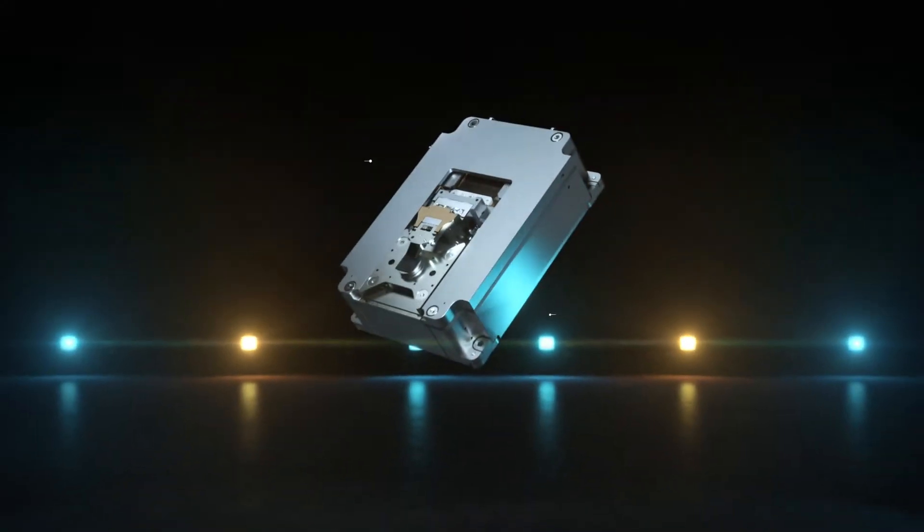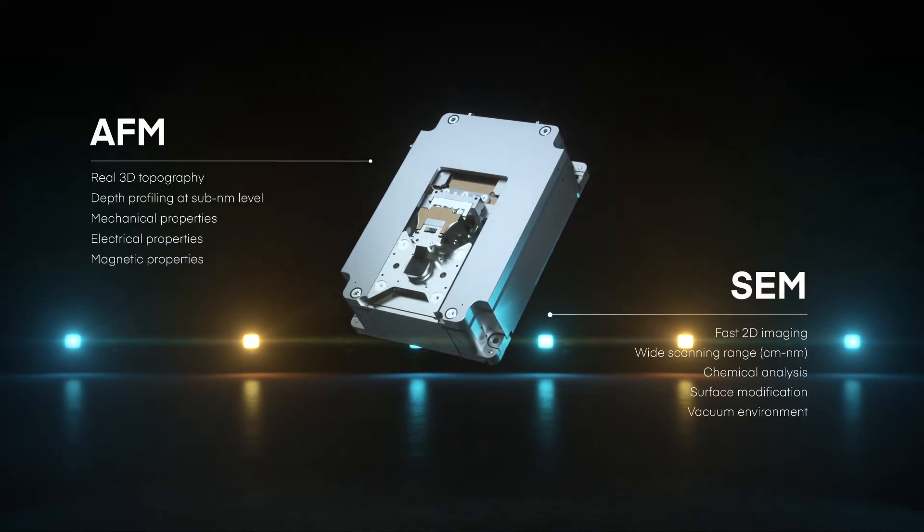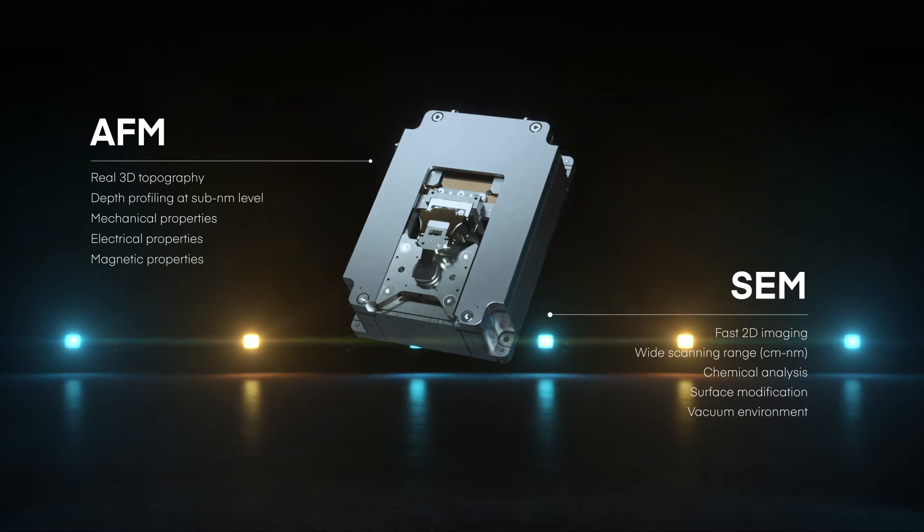With LightScope, you are able to merge the forces of two of the most used techniques for sample analysis on the nanoscale.